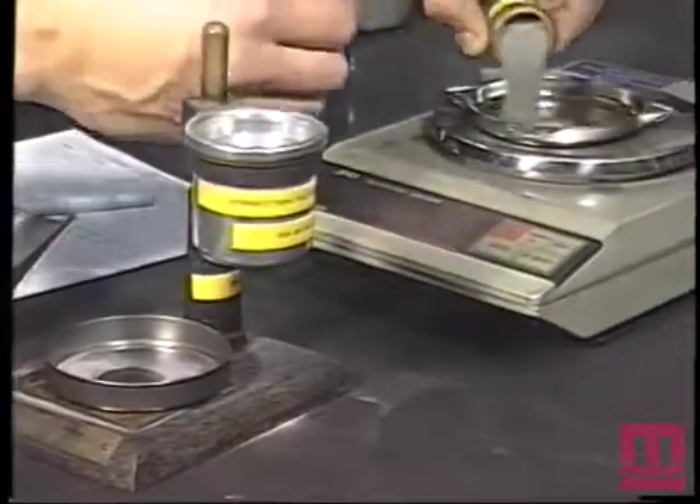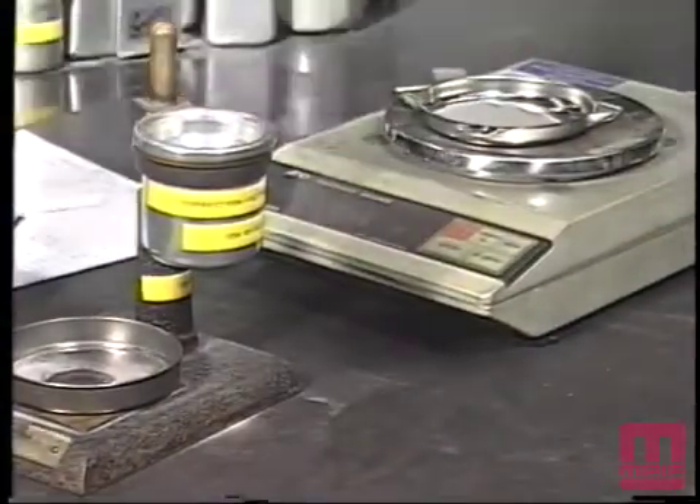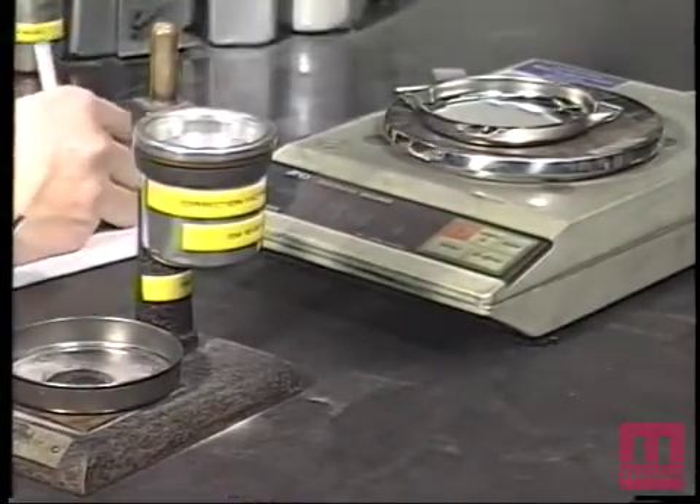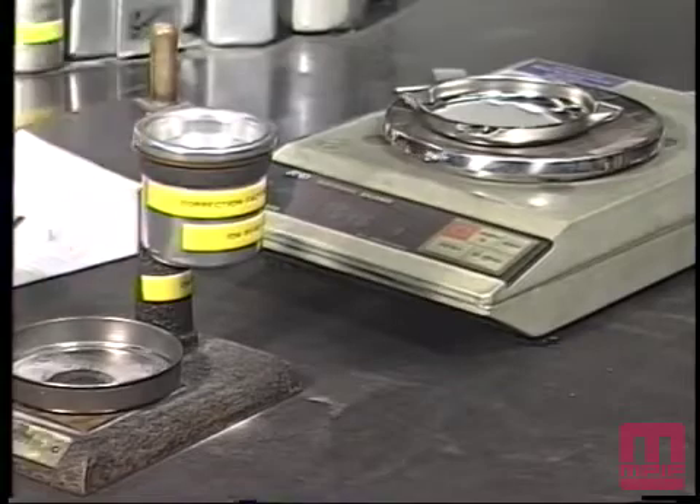The density cup should be lightly tapped on the side to settle the powder to avoid spilling during transfer. The powder shall then be transferred to the balance and weighed to the nearest 0.1 grams.